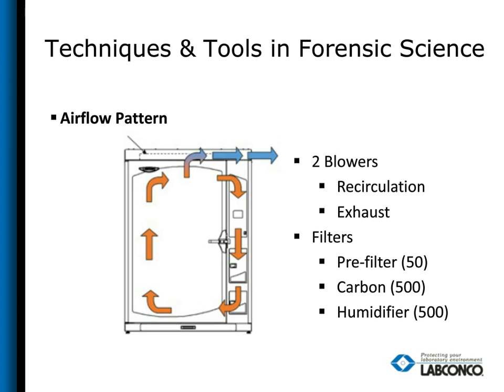All the exhaust is doing is pulling off the CA fumes from the tin and putting them through the filter. But once the automated exhaust stops, those fumes start building back up in the chamber, and you see the evidence being overglued to the point where it can damage it.